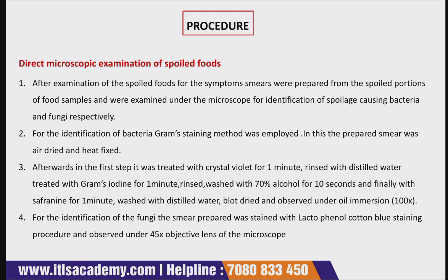So if you want to identify bacteria, then you use the gram staining technique. In this gram staining, the smear that is prepared was air dried and heat fixed.